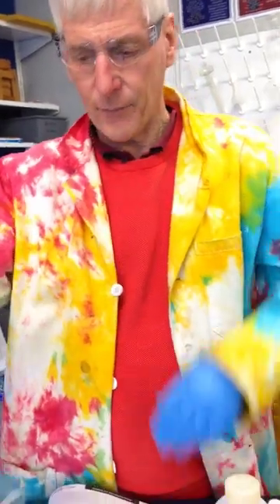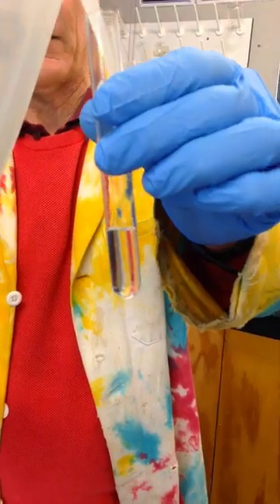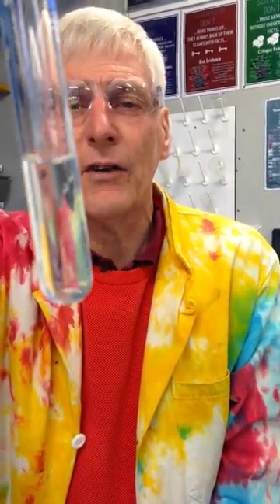Ethanoic acid and water, again, no layers formed, even distributions throughout. As you know from home, mixing vinegar and water, you get a true homogeneous mixture or solution. Now, if you try that with oil and vinegar, of course, which is what you do when you're making mayonnaise, you would get two separate layers that eventually come out of solution.